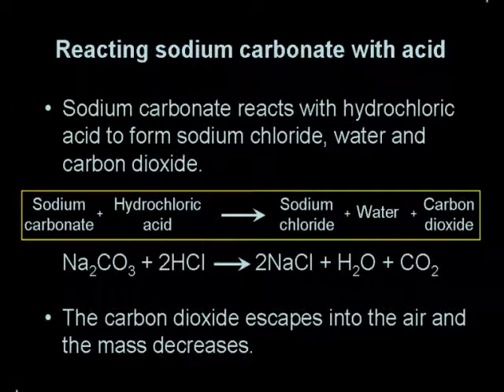So why is this happening? Well, the sodium carbonate reacts with hydrochloric acid to form sodium chloride, water and carbon dioxide. And the key point here is that carbon dioxide is a gas. You saw how fizzy the reaction was as the carbon dioxide was produced, and this was because the carbon dioxide is escaping into the air. Because of this, the mass will decrease.